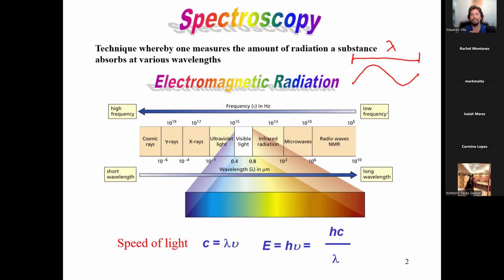And if you've been in the UV room and you looked at that big instrument in the back, that is an NMR spectrometer, which you will learn about next semester, nuclear magnetic resonance. We shoot radio waves in a very strong magnetic field at some compound, and we can find out how many hydrogen atoms it contains very precisely. It's magical almost. And so these have the lowest energy because they have the longest wavelength.